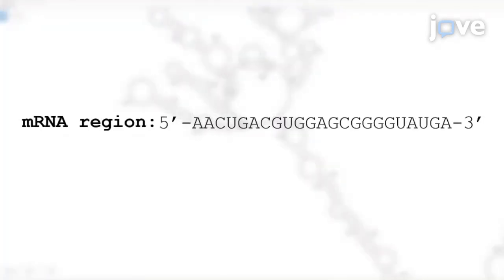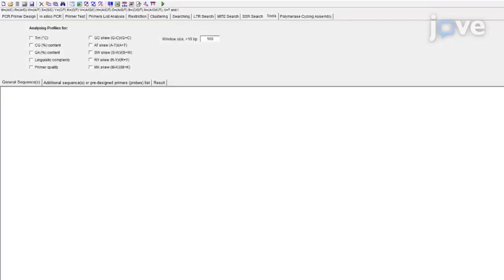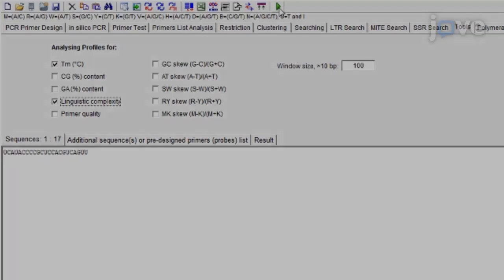Manually design 2' methoxy-modified RNA oligonucleotides bearing a biotin moiety at the 3' end that are fully complementary to the selected regions within the desired target mRNA. Use a suitable online tool to adjust the melting temperature of the RNA hybrids to between 60 and 65 degrees and having a good linguistic sequence complexity.